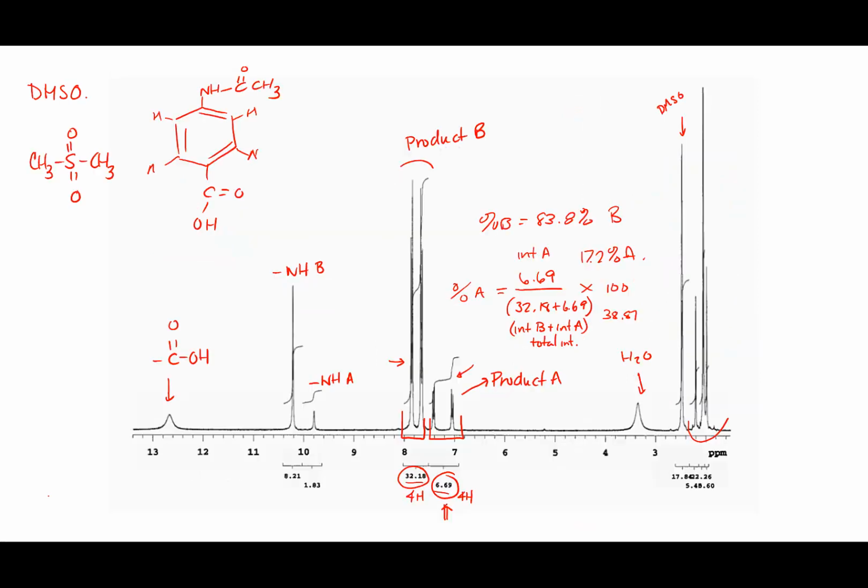What I would like you to do is, for the proton spectrum I'm going to put up that everyone's going to use, make all the assignments, go through and determine the integration values, and the numbers over here are going to change. I'll need to give you the numbers here since they are a mess. So I will go ahead and put those numbers on the spectrum, but you're going to divide through and then make your assignments.